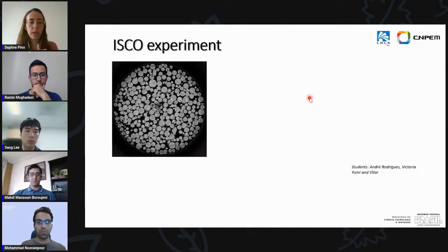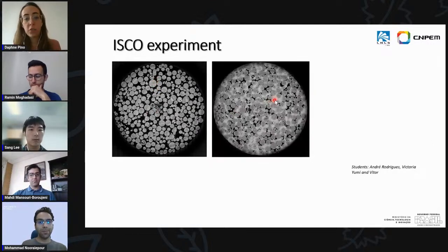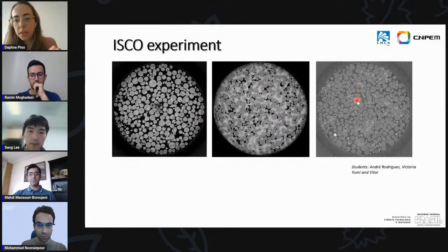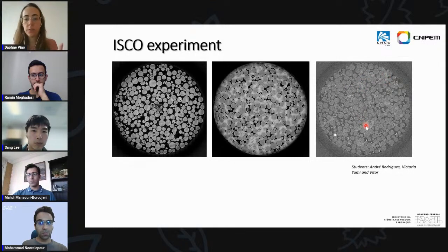The other experiment that I want to show you very fast is for an in-situ chemical oxidation experiment. So here we have again the grains and the water, and here we actually injected the TCE, the contaminant. Sorry for these two, they are filtered, but this one is not yet. After that, we injected permanganate, an oxidant reagent. So we can see that there is a lot less solvent here.